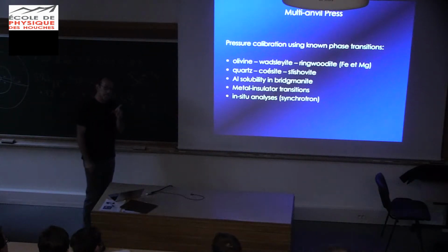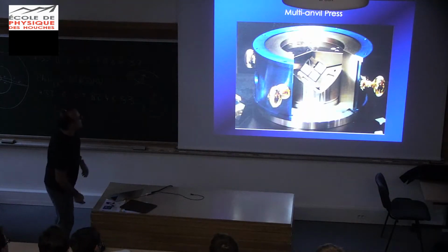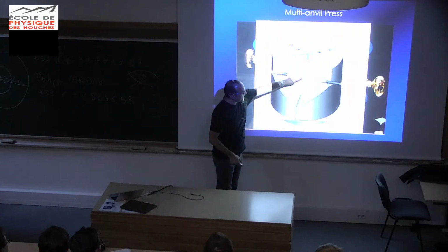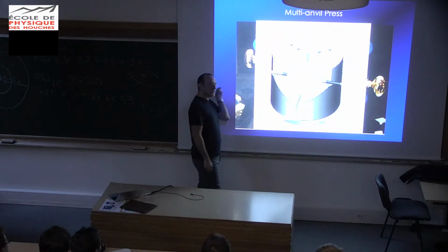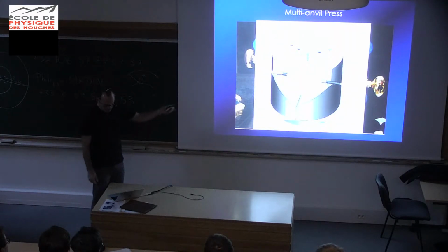And if you have one of these presses on a synchrotron, then you can do in situ measurements with X-rays. Okay, so it's interesting because this is not exactly the way I want to look at it. There is a little opening for X-rays to go through these little assemblies. And you wouldn't use cubes that are exactly like that. They would have a little opening here, just something very tiny, less than a millimeter. And you can send X-rays through and collect X-rays on the other side. And that's for people who do radiography or X-ray diffraction to measure the density of materials. Okay?